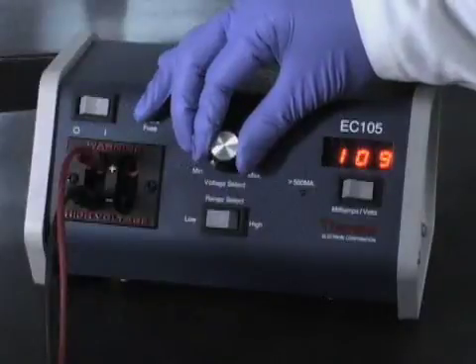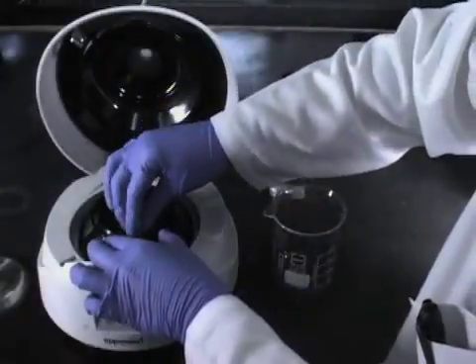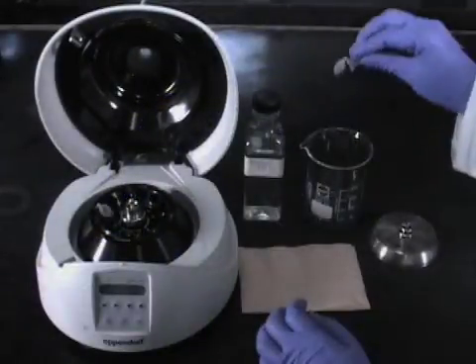However, in spite of the time consumed in this process, you will be able to control many of the variables that will allow you to purify a wider range of samples, varying in nature, sizes, and sources. This is excellent.